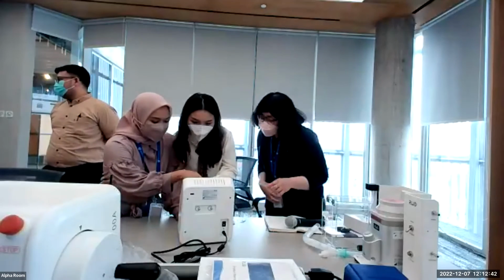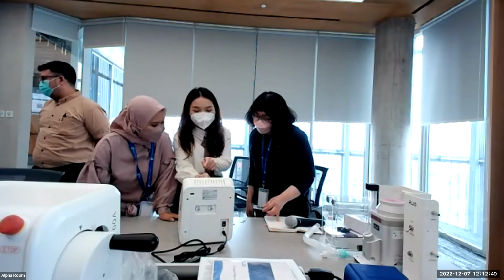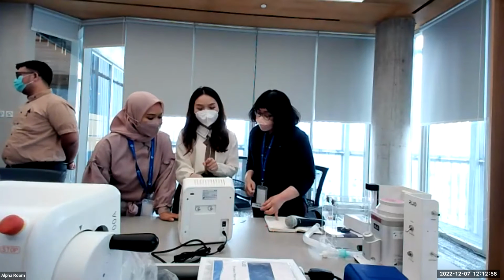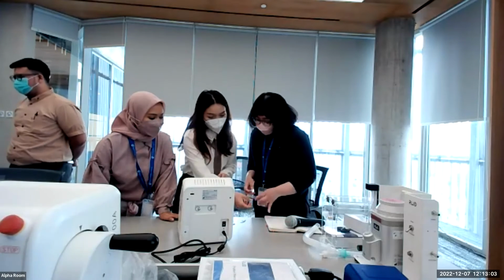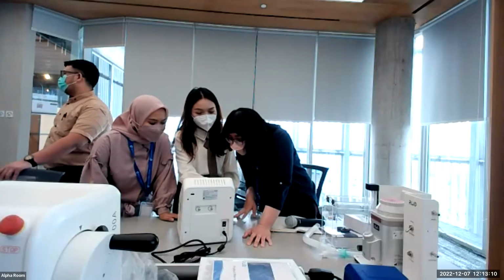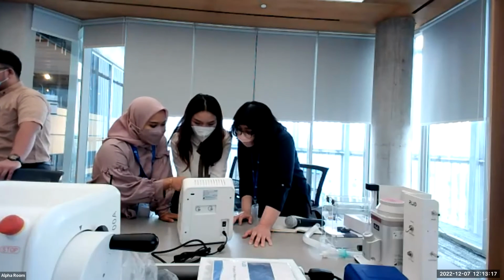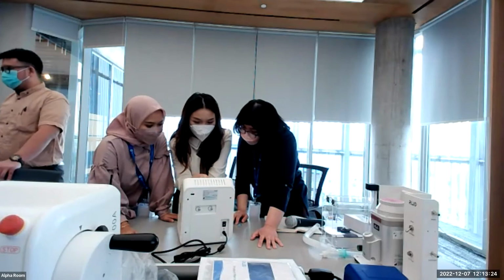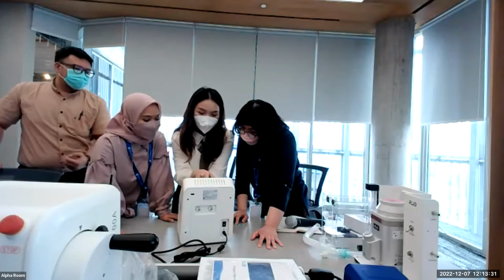What's the difference between quick mode and normal mode? If you choose quick mode here, it will be accurate and quick to count the cells. If you do not click here, maybe sometimes it won't work as well. After the copy, you should choose things like the shape and brightness. Right now it's on auto, not quick mode. We recommend you choose quick mode.